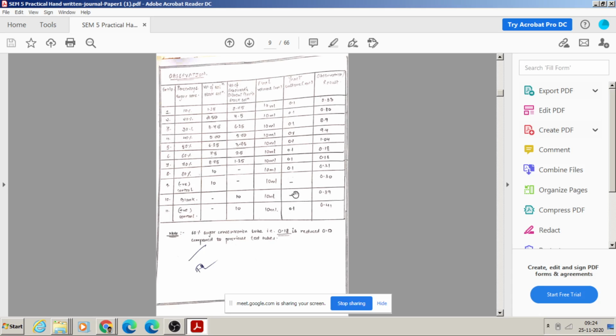So positive control, negative control, and blank are the three basic test tubes we have to make first of all. And of course after that the experimental test tubes are test tube number 1 to 8, in which the concentration may be varied at 10%, 20%, 30 to 80%. In this way, if it is an antimicrobial compound, or an antifungal compound, or an antibiotic, the concentrations may be in molar solution, in ppm, or in micro quantity solutions, if you want to test the antibacterial compound or antibiotic. So at present we have selected percentage solution.